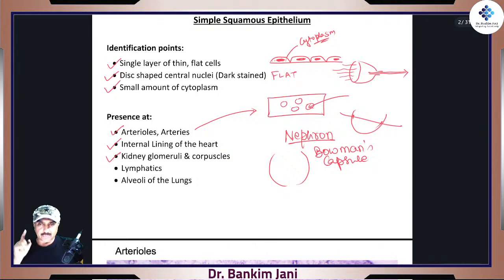Bowman's capsule, same thing, under pressure. So over here there would be afferent vessels, they will be getting right over here, and then there will be efferent.